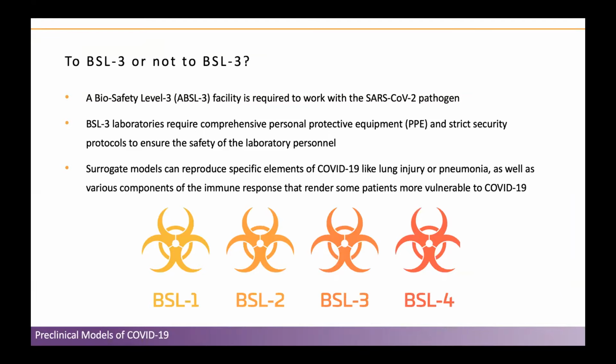If you're working with the COVID-19 virus directly, you need to be in a BSL3 or a BSL4 lab. These labs require comprehensive PPE, safety protocols, and security. Many of you I saw are working within these labs. If you have access to these, you can work directly with COVID-19.